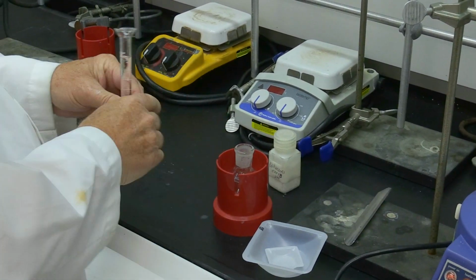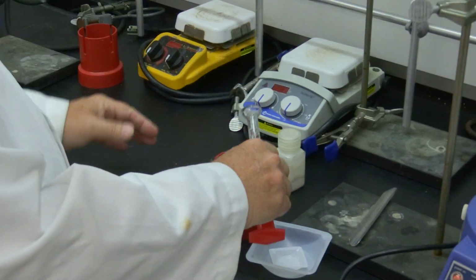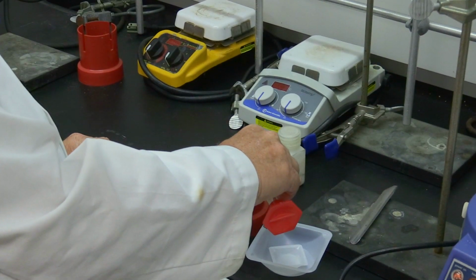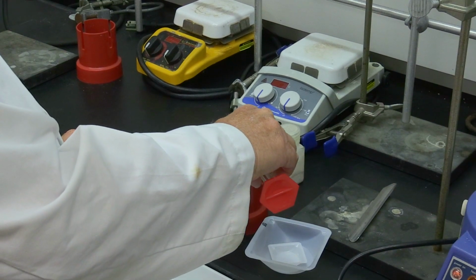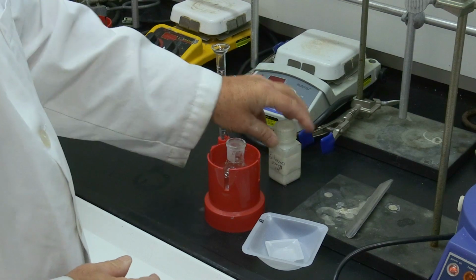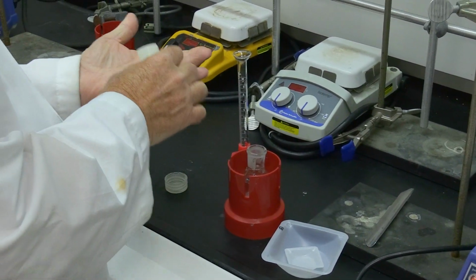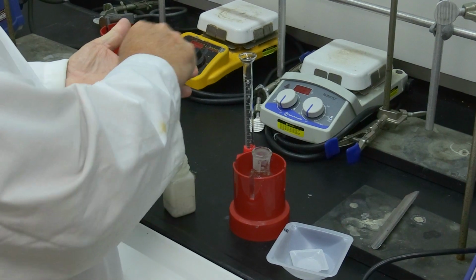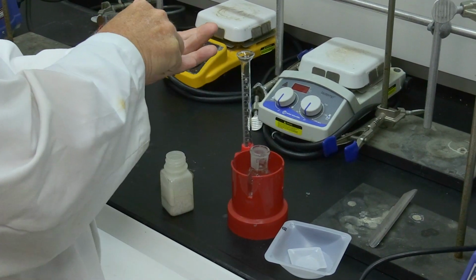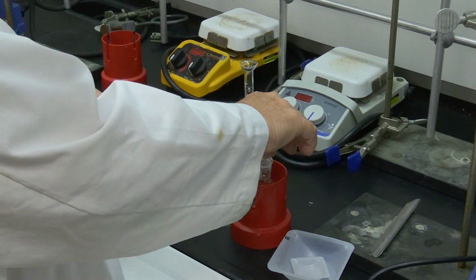Add our mixture of benzaldehyde and benzyl alcohol in different quantities from part A. Add our couple of boiling chips. This is the only substance you handle with your hands because it's just a rock, limestone.